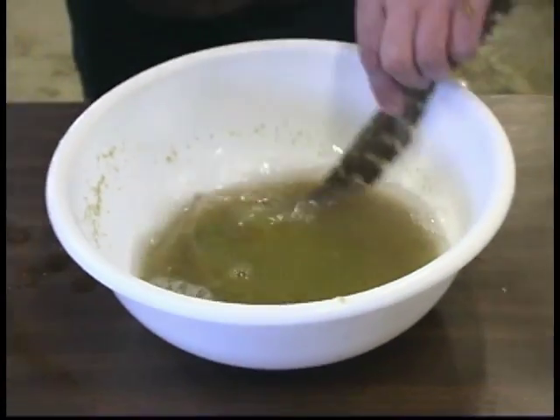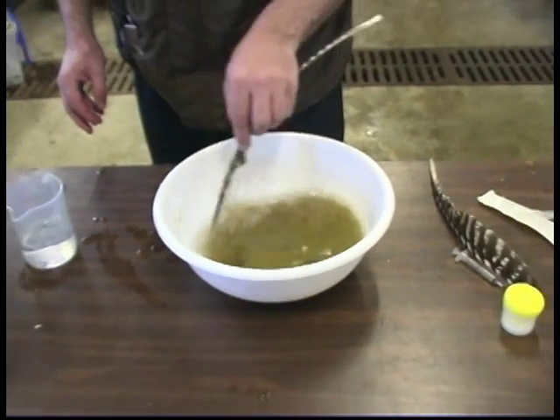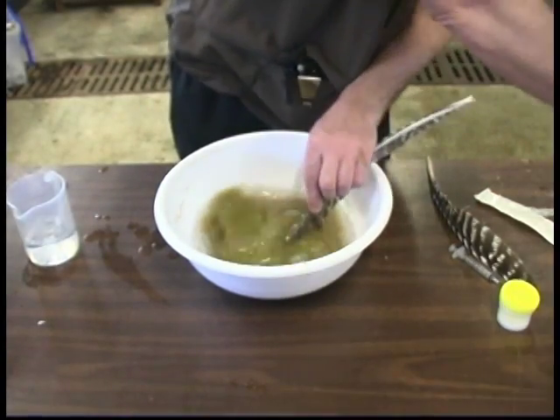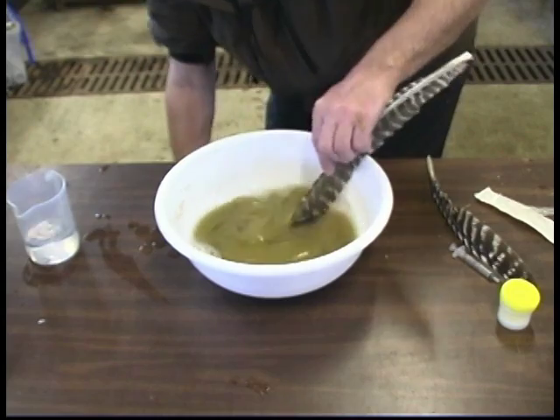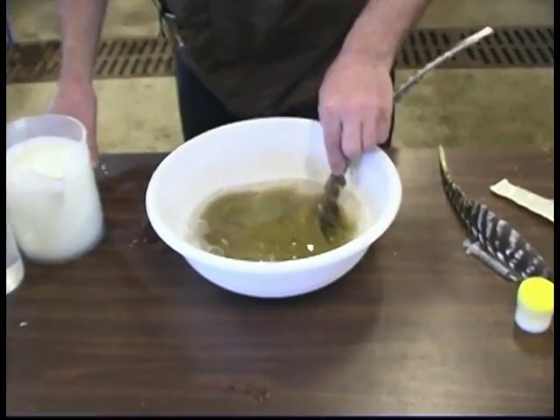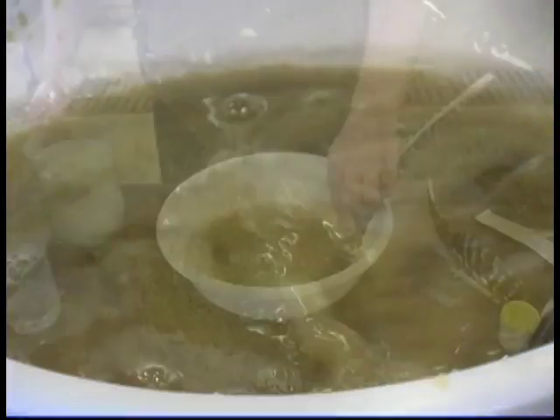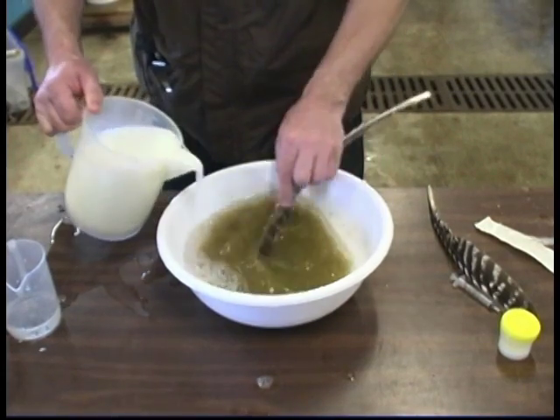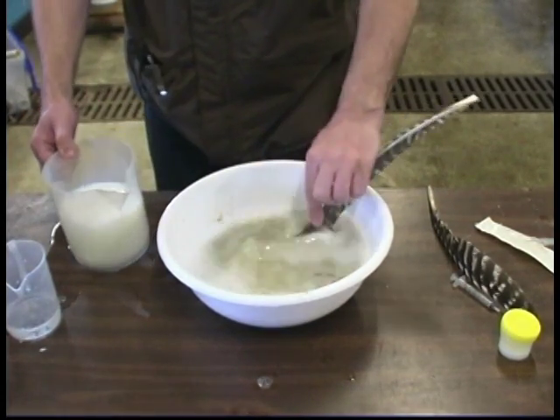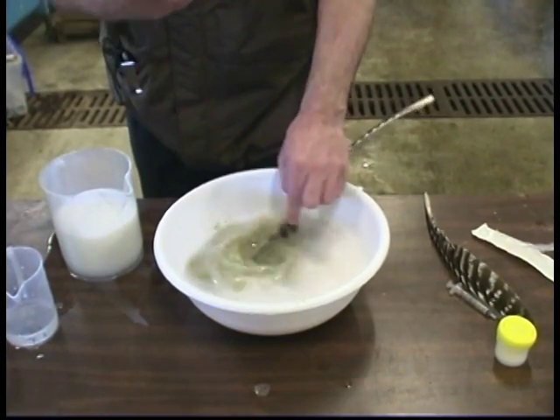After about one and a half to two minutes, I will add a little more water and then start adding milk, because I saw that the eggs are starting to clump.